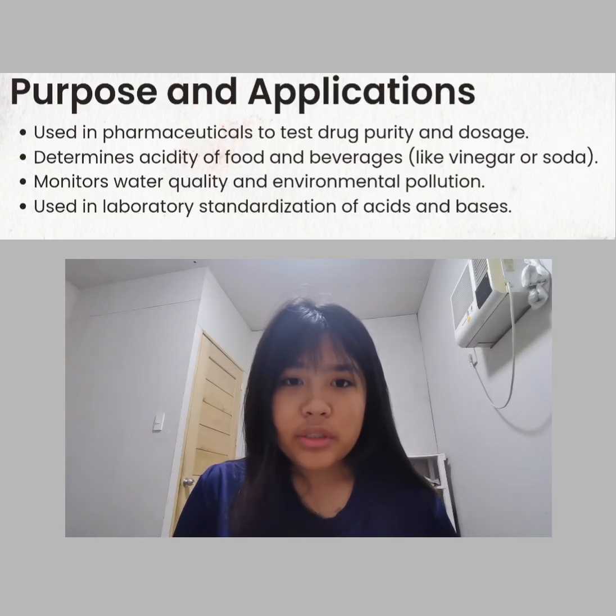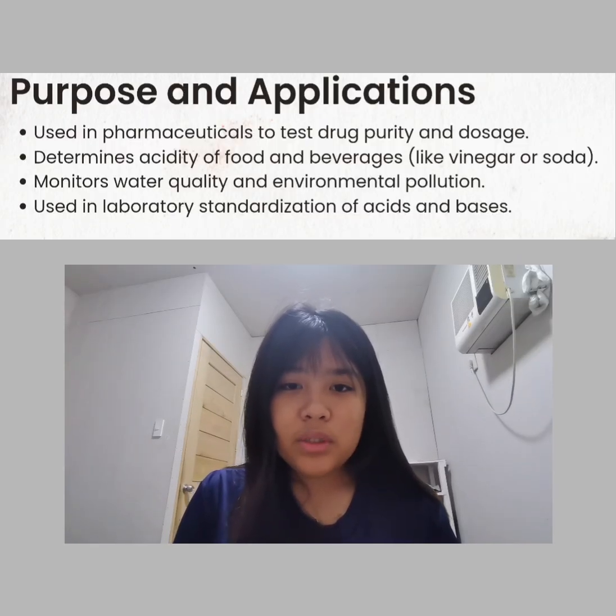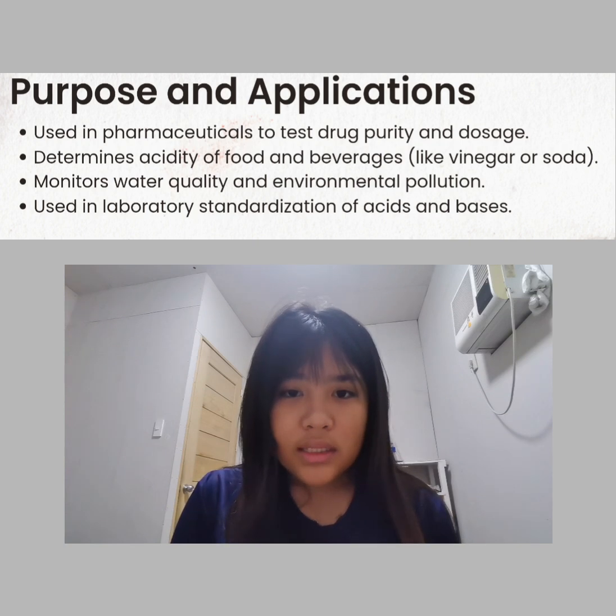Purpose and application. First, it is used in pharmaceuticals to test drug purity and dosage. Second, to determine the acidity of food and beverages. Third, to monitor water quality and environmental pollution. Lastly, it is used in laboratory standardization of acid and base.